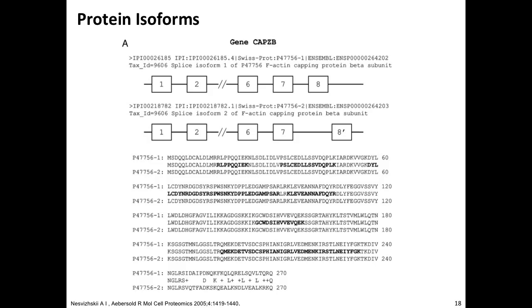You can imagine some of them have a very low copy number. And then you run into effects that it becomes hard to really detect that. So in very rare cases will you see more than 50% of these proteins covered. For the most part, it is individual peptides here or there, so you see only a fraction.